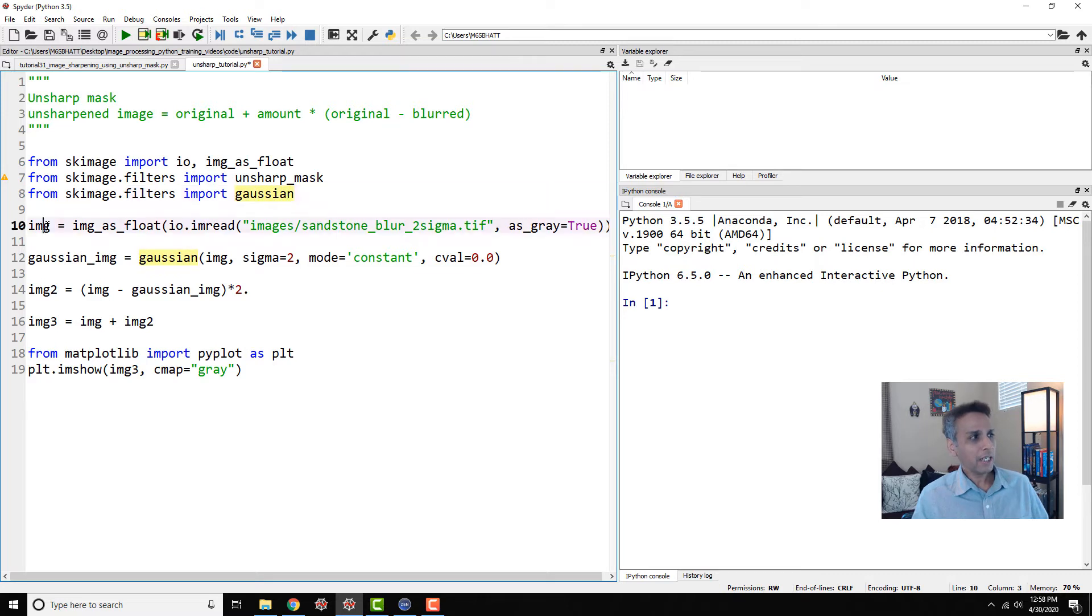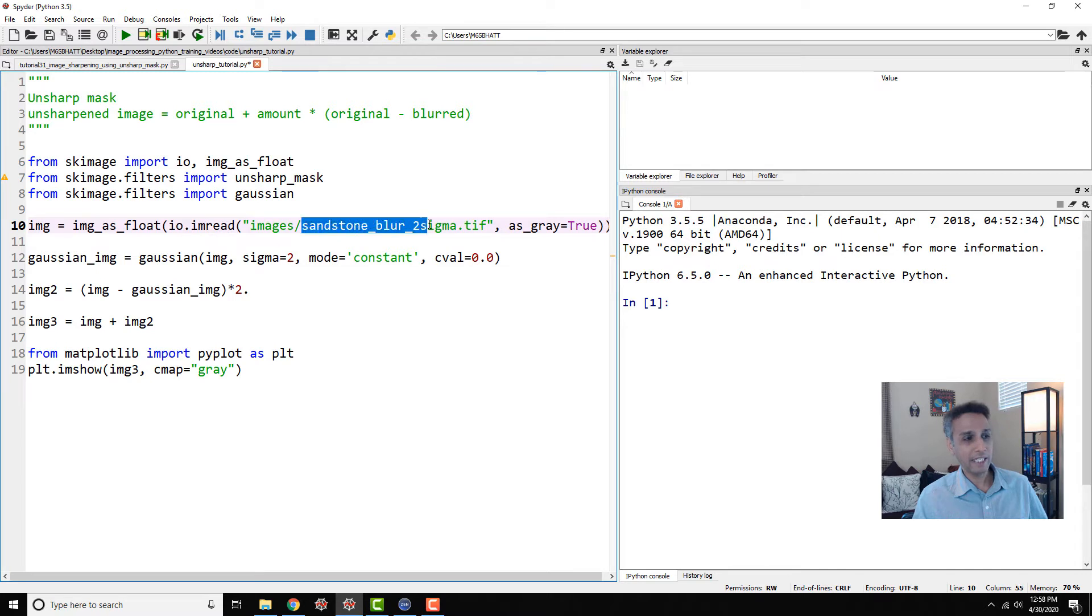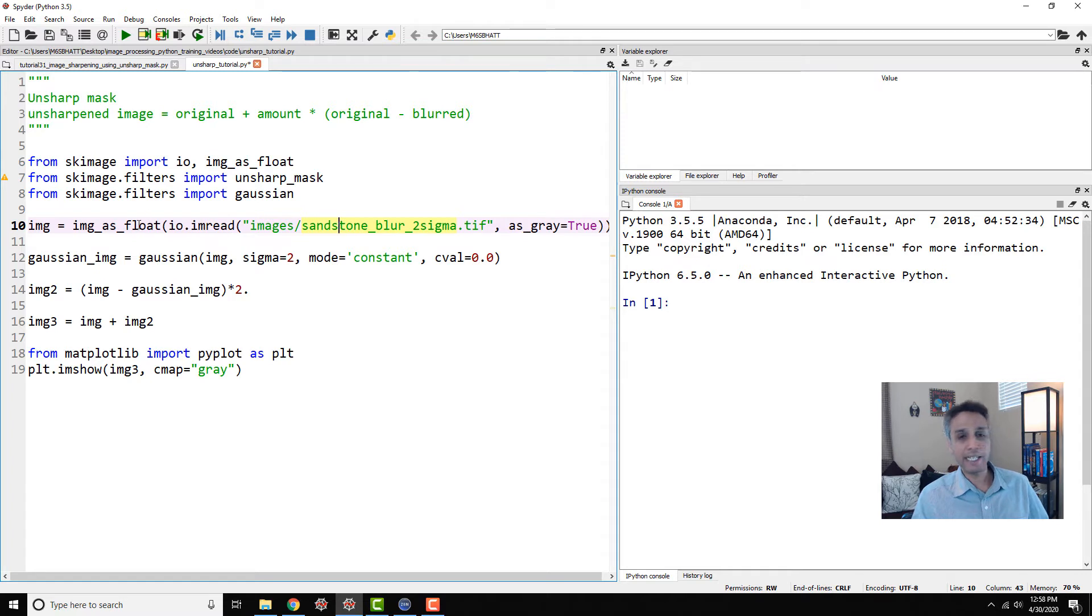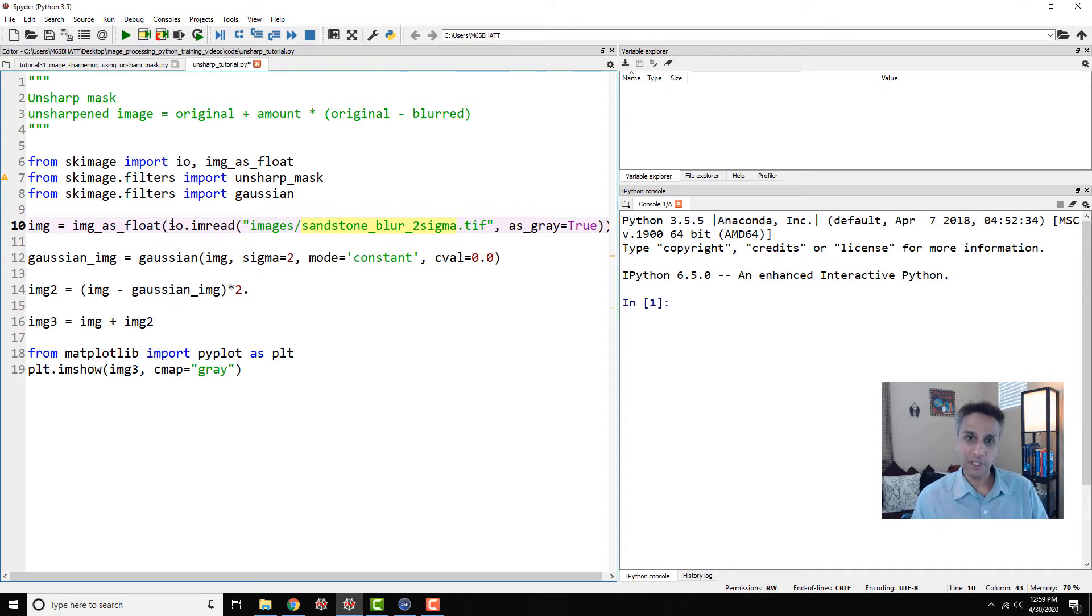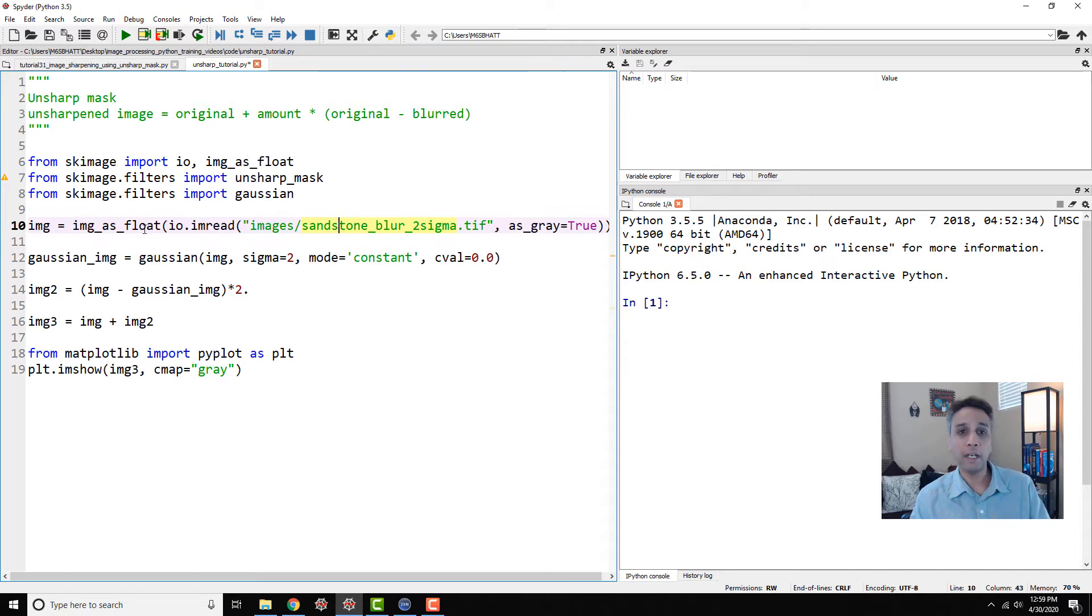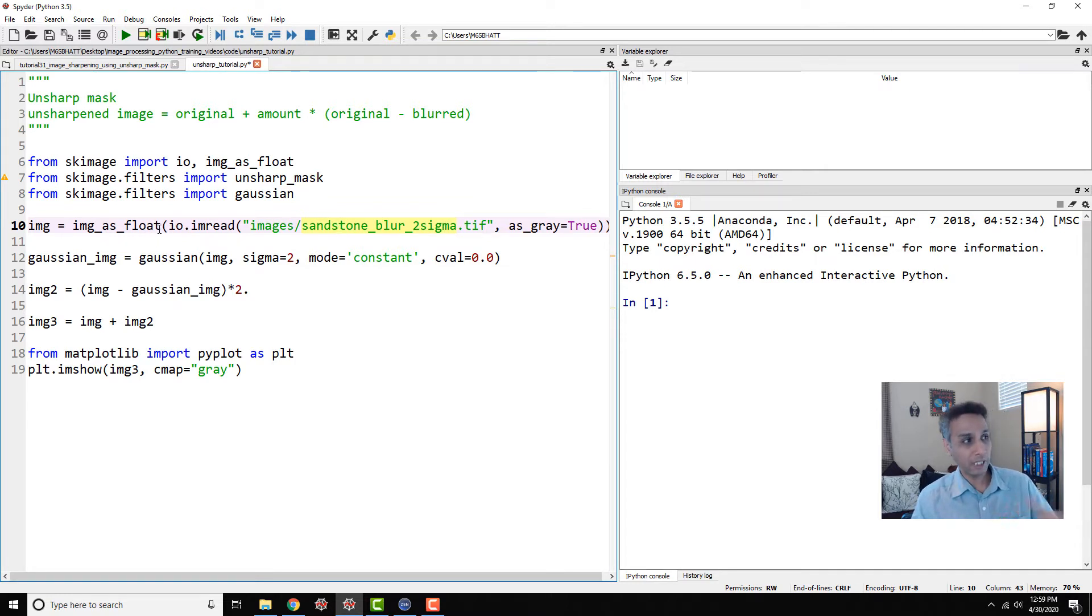Here I'm reading an image using io.imread, we looked at this in the last few tutorials. The image I'm going to read is a sandstone image which has been blurred by two sigma, artificially blurred by applying a two sigma Gaussian blur. I'm reading it as float because most of the time if you want to apply scikit-image filters you may be forced to convert your images into float. Please experiment, try by not doing float and see what error message shows up.